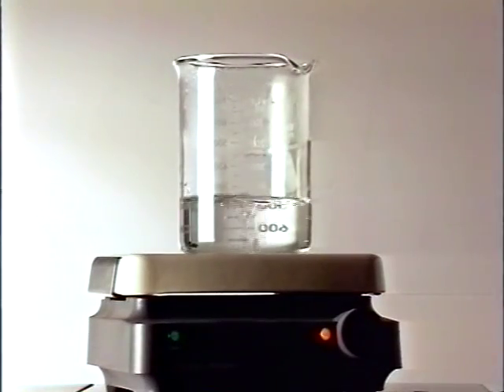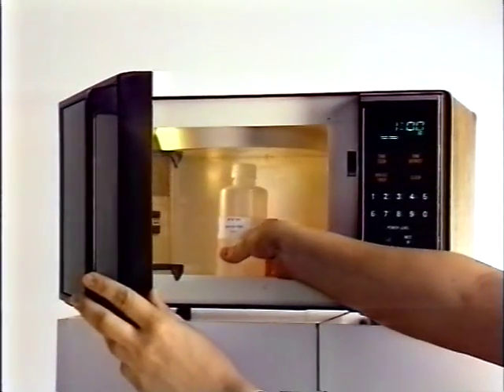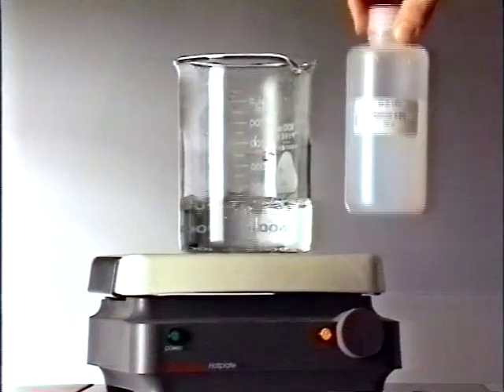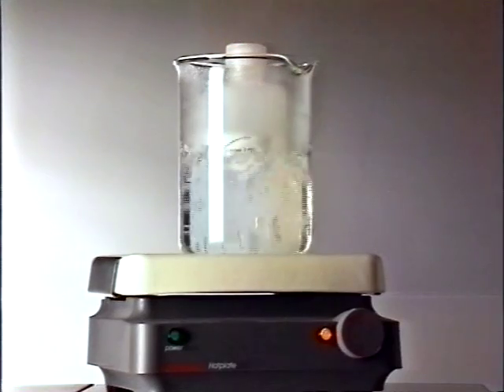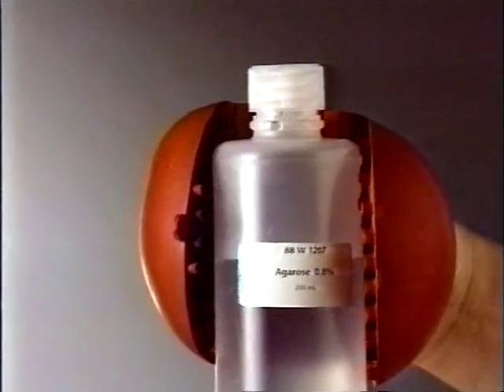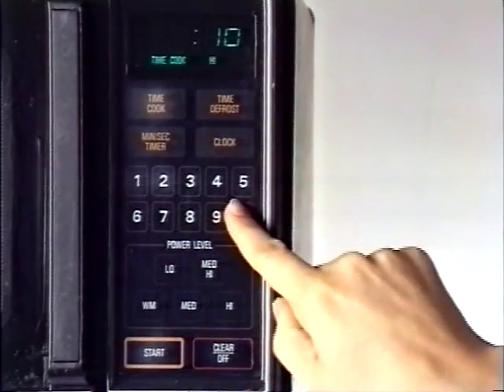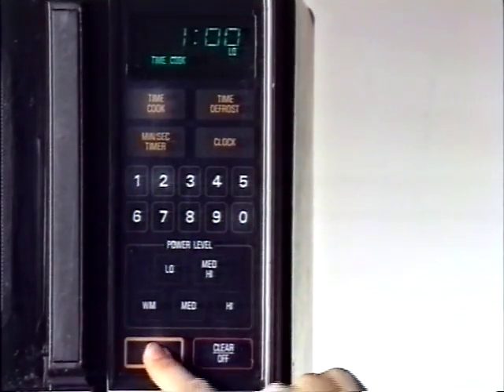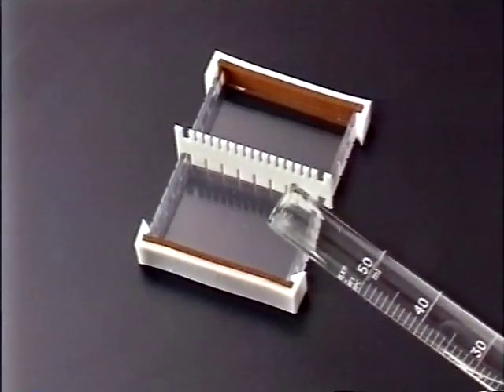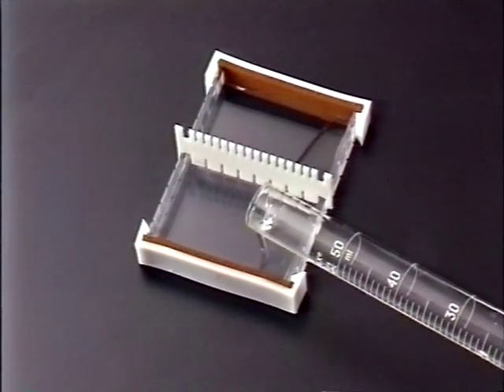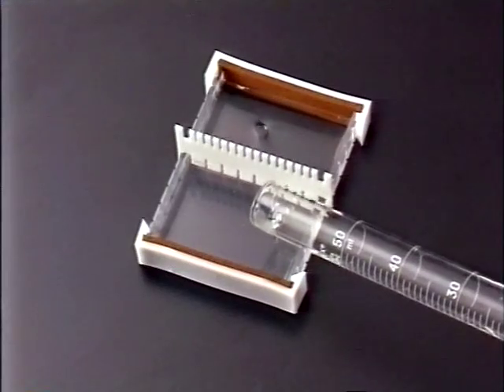Melt the prepared agarose in either a hot water bath or microwave. If you use a hot water bath, loosen the cap on the agarose bottle and place it in a 100 degree centigrade water bath until the agarose is completely melted. If you use a microwave, loosen the cap on the agarose bottle and heat in 1 minute intervals on low power until the agarose is completely melted. Pour enough melted agarose into the tray to cover the bottom to a depth of 3 to 4 mm. This will require approximately 25 ml of melted agarose gel.